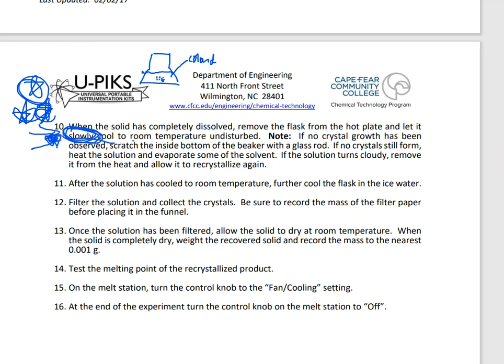After it goes to room temperature, then you put it into an ice bath. That is step number 11. So after it goes to room temp, which means that you can hold it with your bare hands and not go, ow, ow, ow, then you're good to go. Put it into an ice bath from that point on.